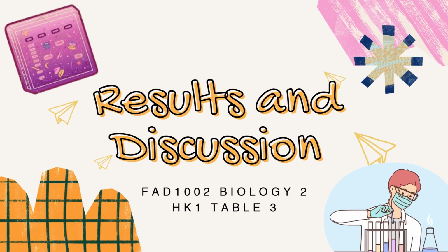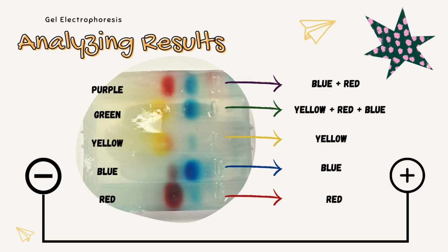Hi everyone! After waiting for 15 to 20 minutes, let's look at the result. Ta-da! As you can see over here, all the colored dye had traveled from its initial position in the well. For your information, the holes here are called wells. The colored dye will travel from positive electrode to negative electrode respectively.